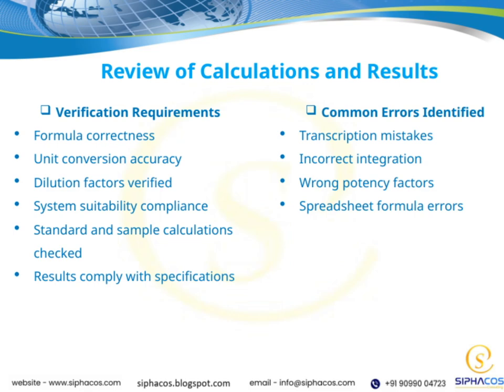Using the wrong values can significantly impact the validity of our calculations. Spreadsheet formula errors are quite common, especially if formulas are not checked thoroughly. They can cause incorrect results across the board. Now, moving beyond errors, it's crucial that we review all calculations and results carefully.